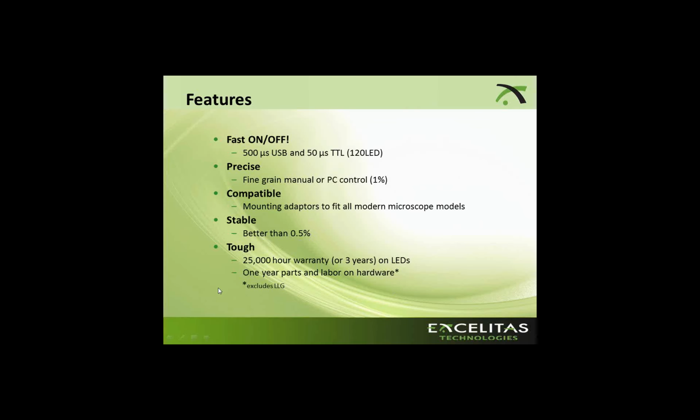And as I mentioned, over 670 nanometers and under 360 nanometers, LEDs are just not practical, and lamps are still very useful in this space. Like I said, lamps have been around forever. People are used to them. They're comfortable with them.